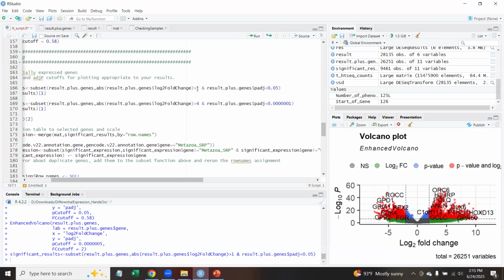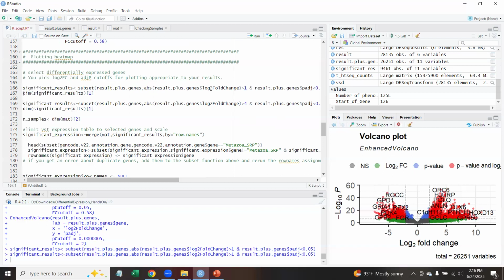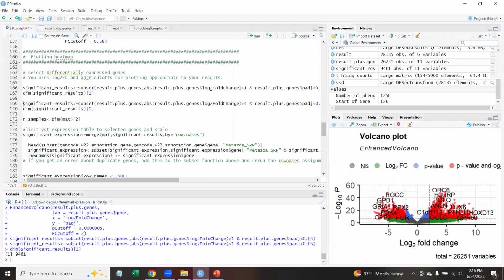First round, I did a fold change, either up or down, using an absolute value of 1, so either greater than 1 or less than -1. And I require that the adjusted p-value is less than 0.05. I know this is going to give us a lot of genes. Yeah, nearly 10,000 genes. And if we plot that on a heat map, the heat map's going to complain.